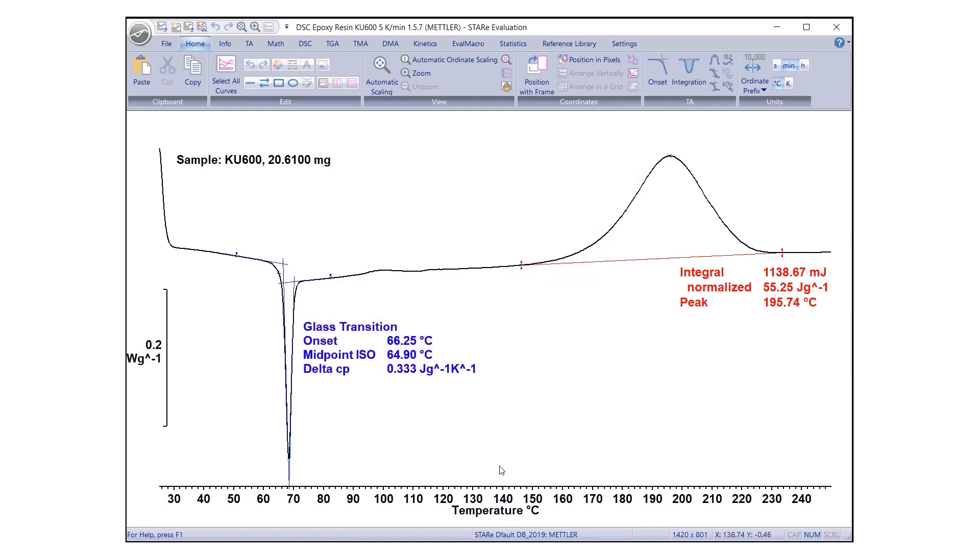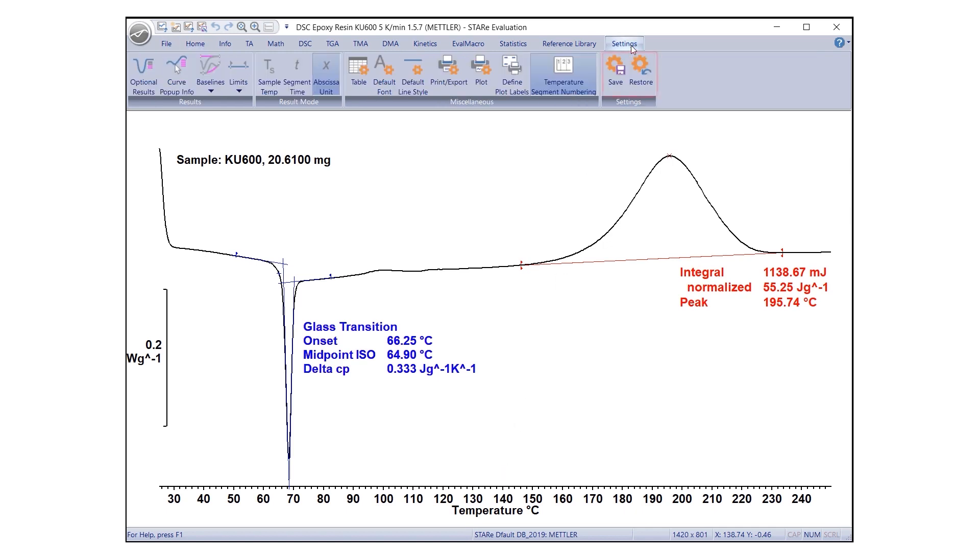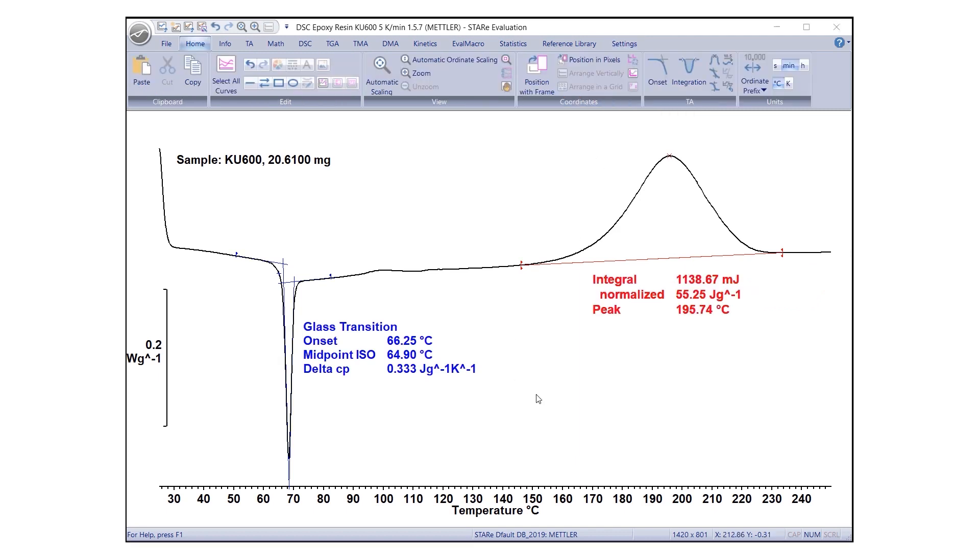The current preference settings can be saved in your user profile by clicking Save under the Settings tab. To restore the previous settings, click Restore. To improve the appearance and readability of results, you can change the position and alignment of text in the Evaluation window.